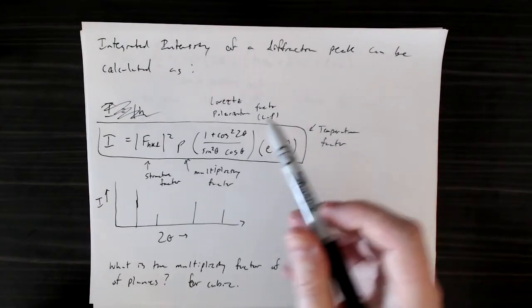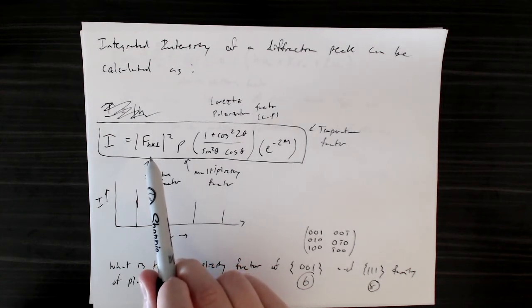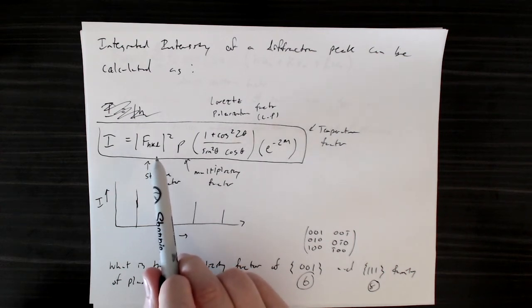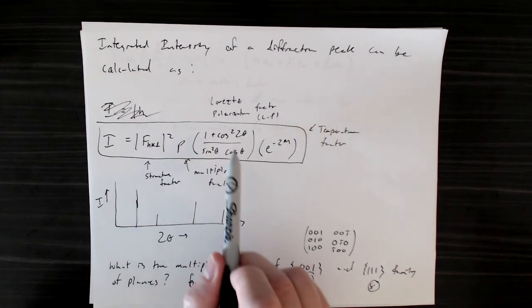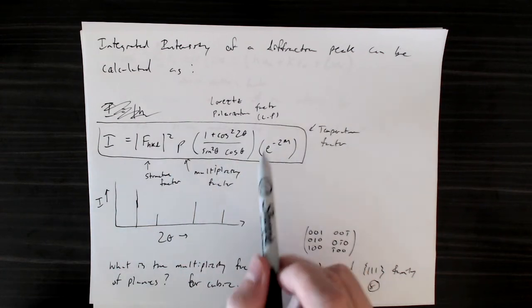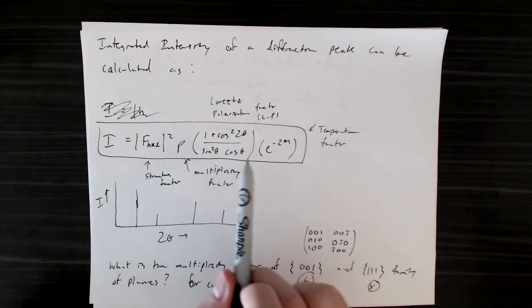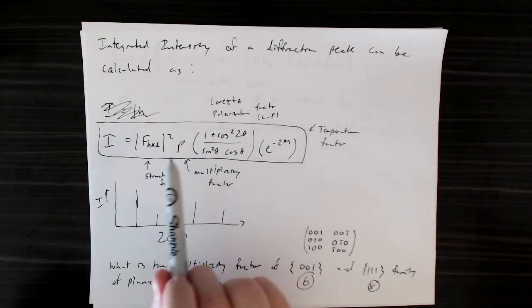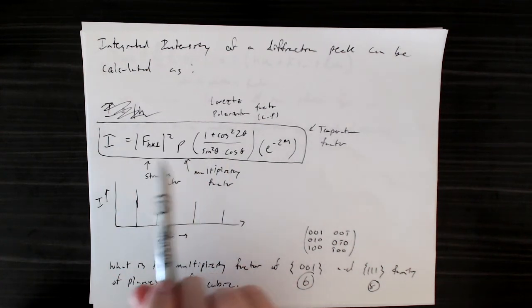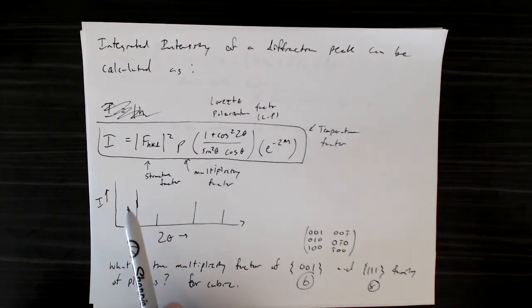All right, that takes us through the intensity for a given peak. We have the structure factor, and we've shown how to do this, the multiplicity, where to find that, and how to calculate or find the other terms. There's a lot of information here that I would definitely input into a spreadsheet, but you'll want to do that for all the predicted peaks of your pattern in order to determine the relative intensities.